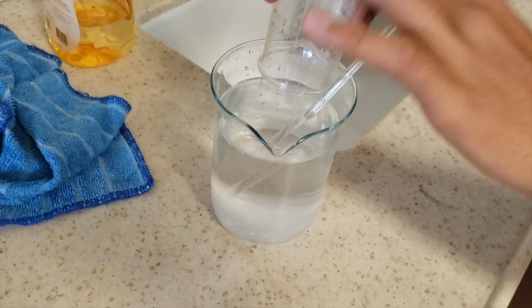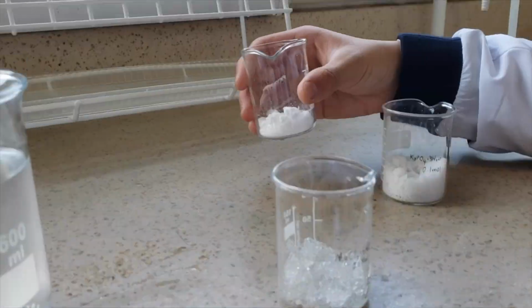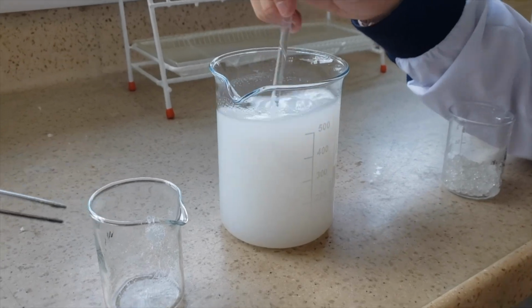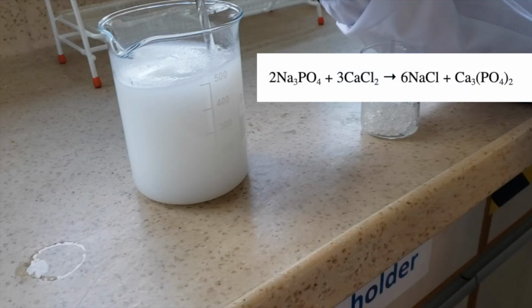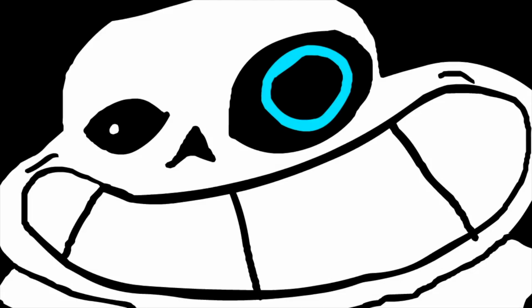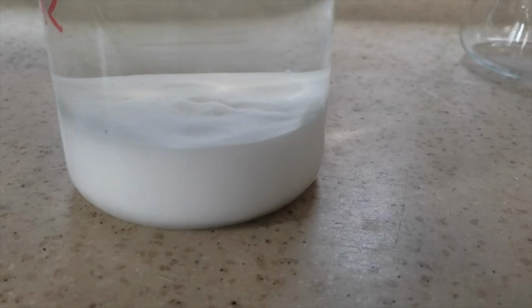For the first part of the experiment, we decided to use sodium phosphate to simulate excess fertilizers dissolved in water. After we dissolved everything, we decided to add calcium chloride into the solution, and instantly, white precipitate can be seen forming. Right now, the sodium phosphate is reacting with calcium chloride to form sodium chloride and insoluble calcium phosphate, which is basically what makes up bones.